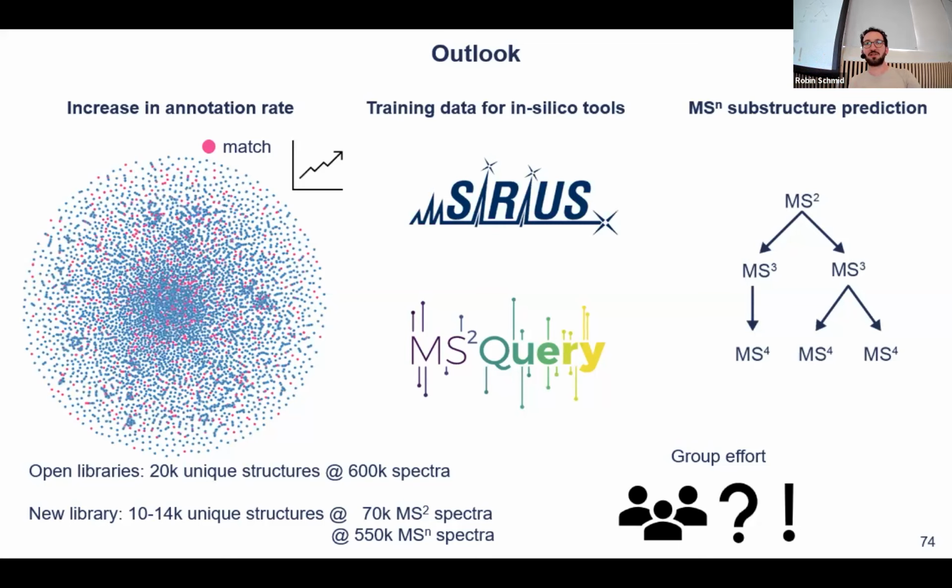And that's also what we try to do, so that people know what happened to the spectra, that we can apply some filtering and automatically tag the spectra. And then people can say, I only want the spectral libraries of this person and this machine. So you can filter by metadata and also by tags and say, okay, I want very confident MS2 spectra.